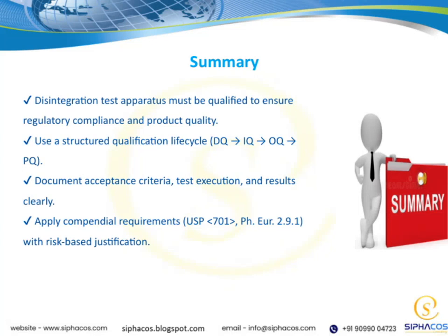Let's wrap up with some key takeaways. First, it's essential that the disintegration test apparatus undergoes proper qualification to meet regulatory standards and ensure the quality of the product. This means following a structured qualification lifecycle, starting from design qualification, then installation qualification, operational qualification, and performance qualification. Each step plays a crucial role in confirming that the equipment performs as intended.